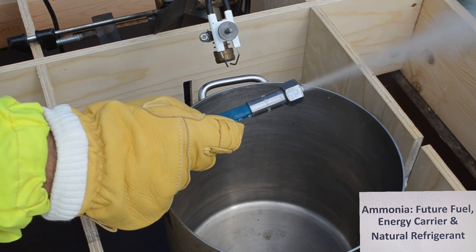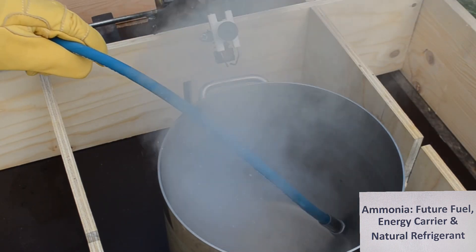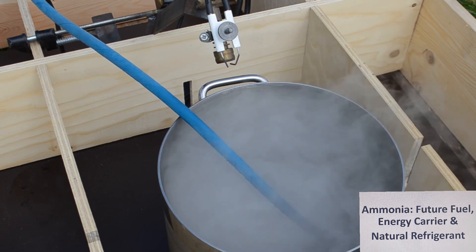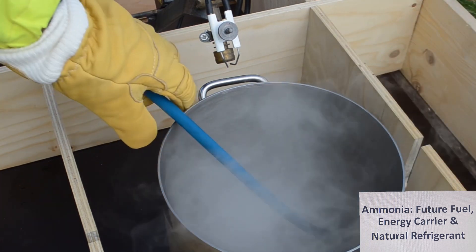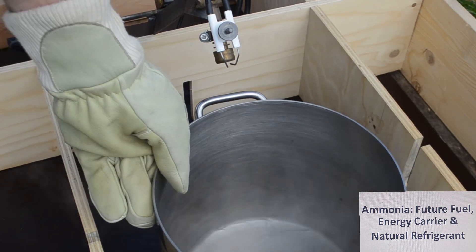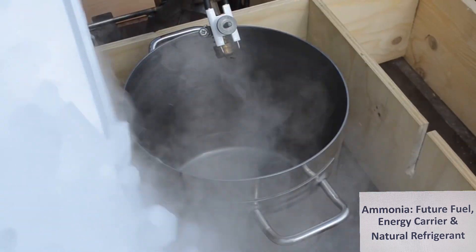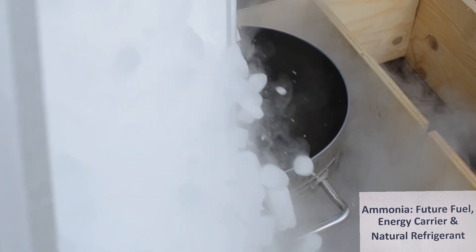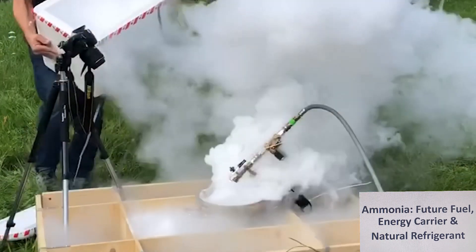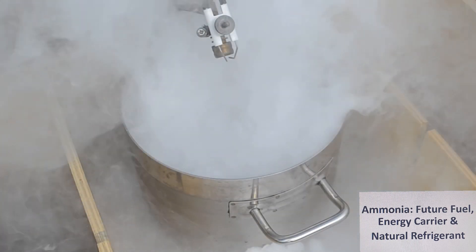Now we fill in a little bit of ammonia into the bucket. The ammonia has a temperature of less than minus 30 degrees, and we filled in dry ice to avoid the ammonia from evaporating too fast. You saw here that a piece of dry ice fell into the ammonia and immediately evaporated.